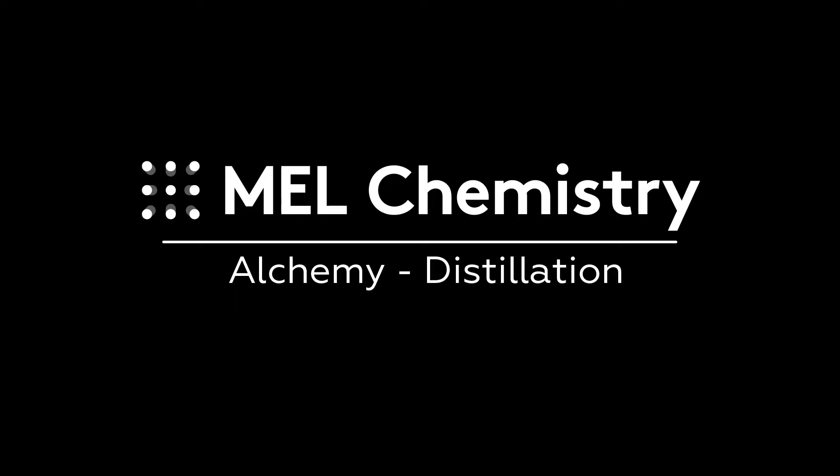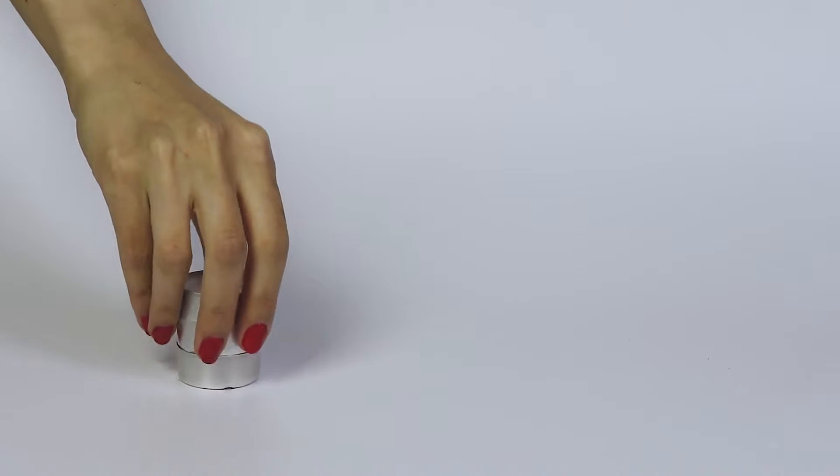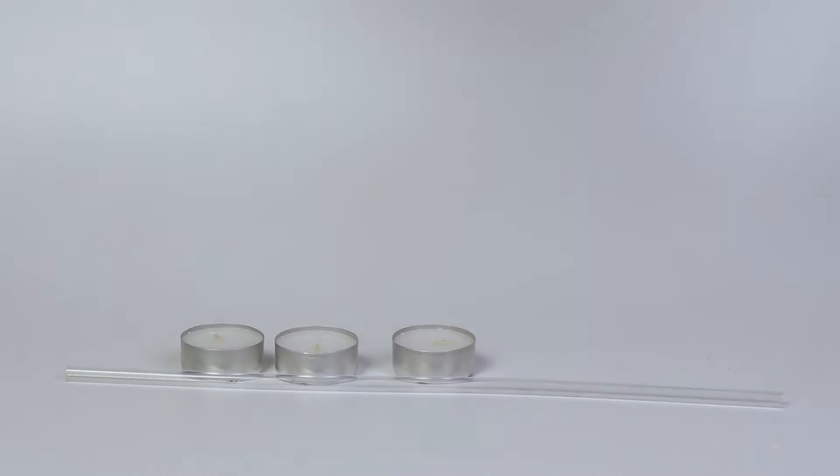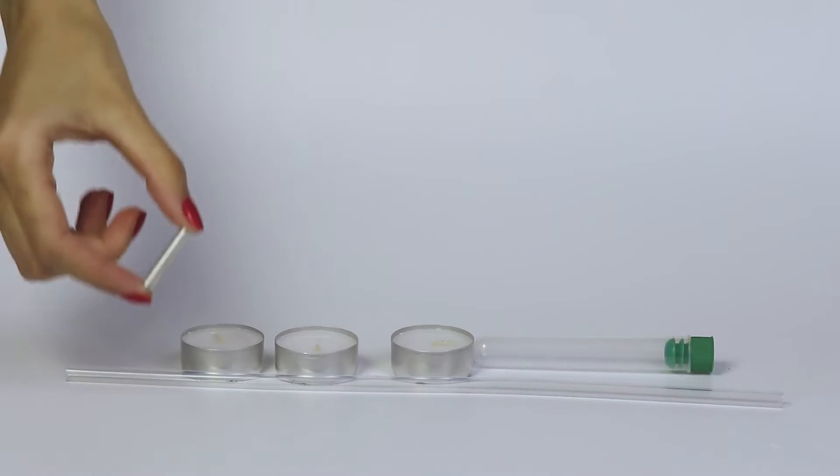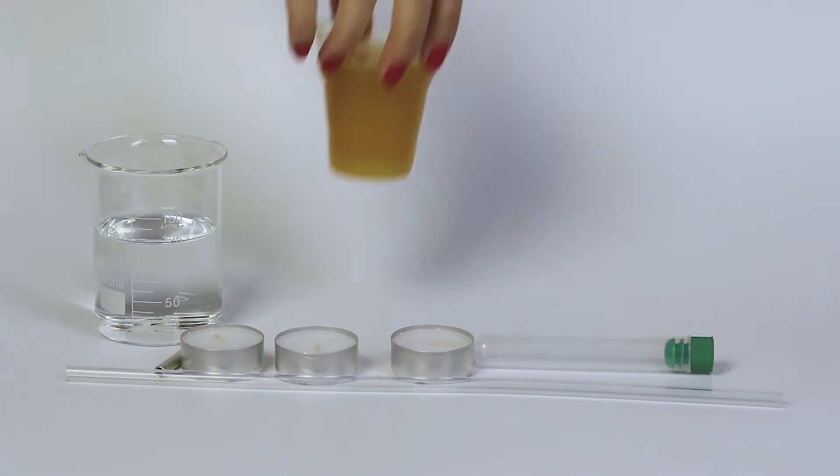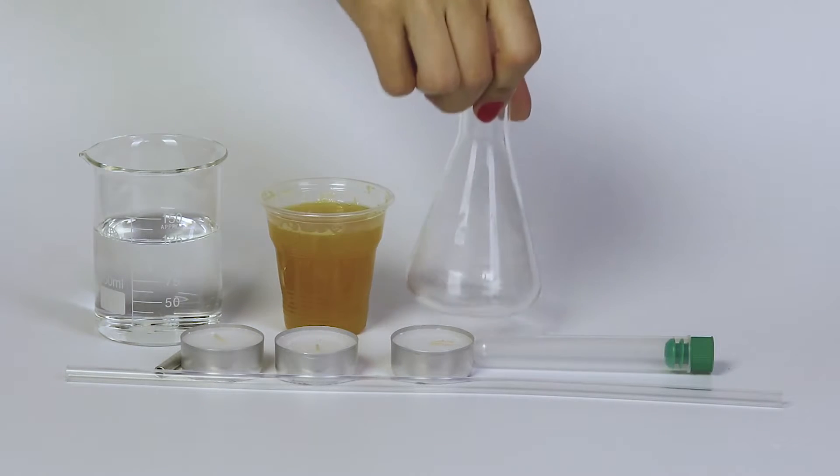For the distillation experiment, you will need three candles, a silicon tube, a test tube with a stopper, a metallic cylinder, a beaker filled with cool water, fruit juice, the flask, and the funnel.